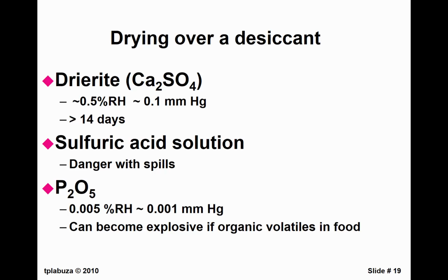Well, what was happening, the glycerol was volatilizing and reacting with the phosphorus pentoxide, and it becomes very explosive at that point. So they called the Minneapolis bomb squad. Got everybody out of the building and took it to some place where they could ram it with something, and the thing blew up. They sent me some pictures of it, which unfortunately I lost. But so don't use phosphorus pentoxide.